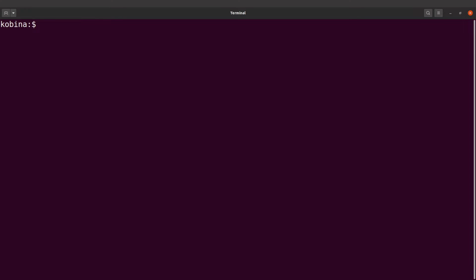Okay, we are on the terminal now. So what we will do first is to create a working directory. So we will say mkdir RNA-Seq, and then we are going to cd into it. This means that the files that we will generate will all be saved in this directory. And it's important we do this because we would like to separate all the files that we are going to generate from files that are already on our PC. Okay, so now we have created it, we have cd'd into it.